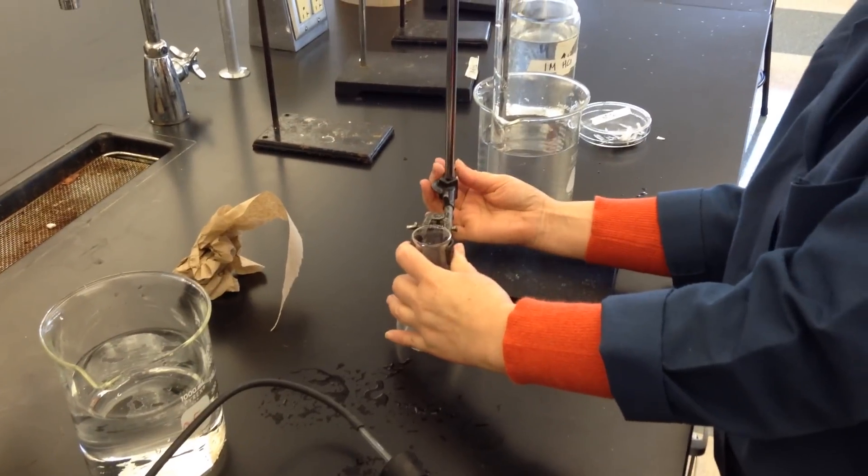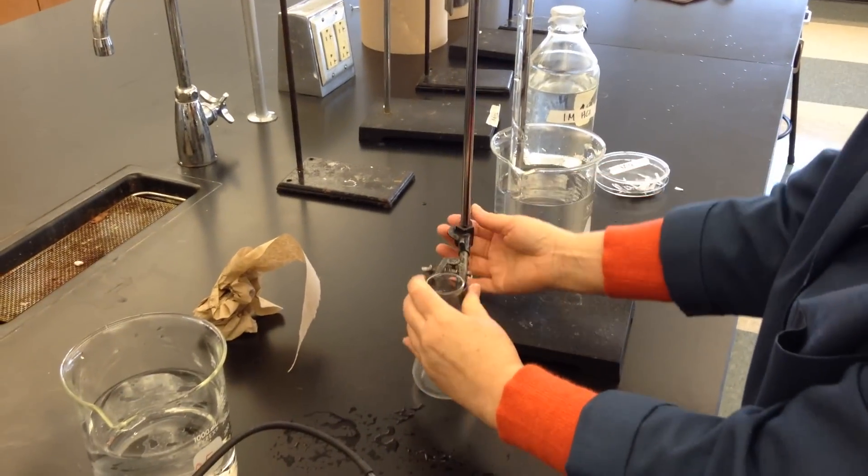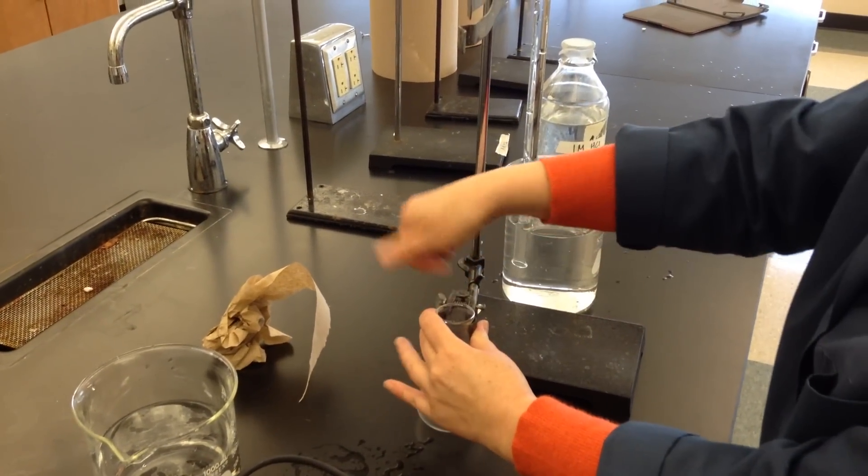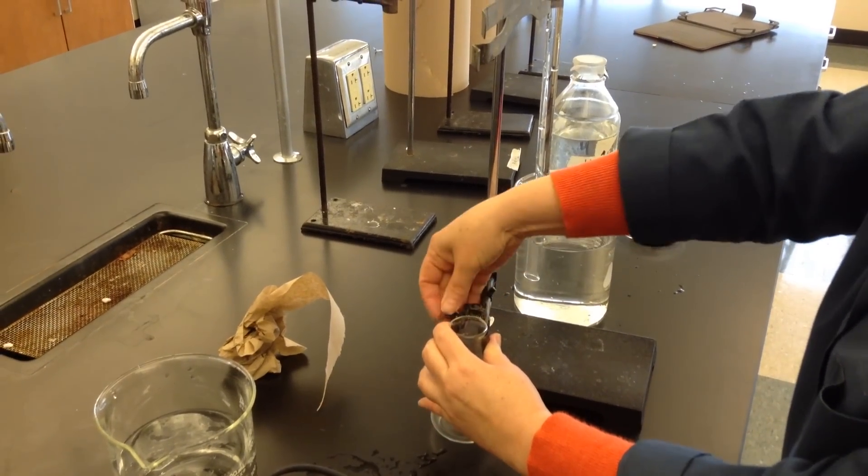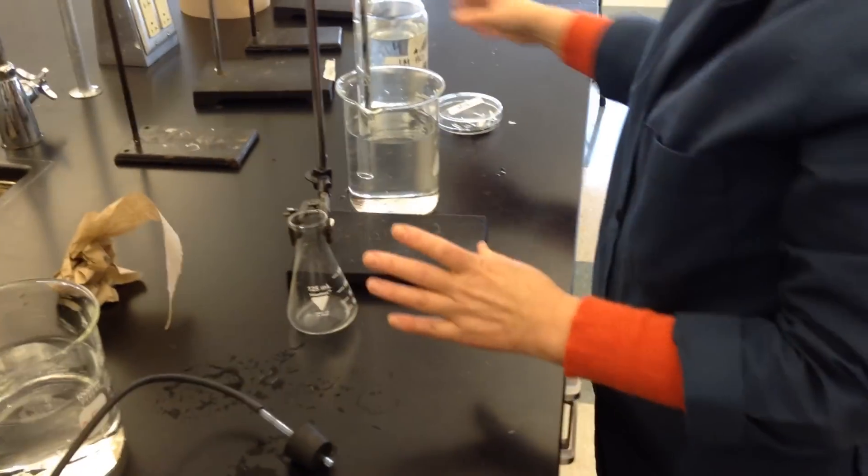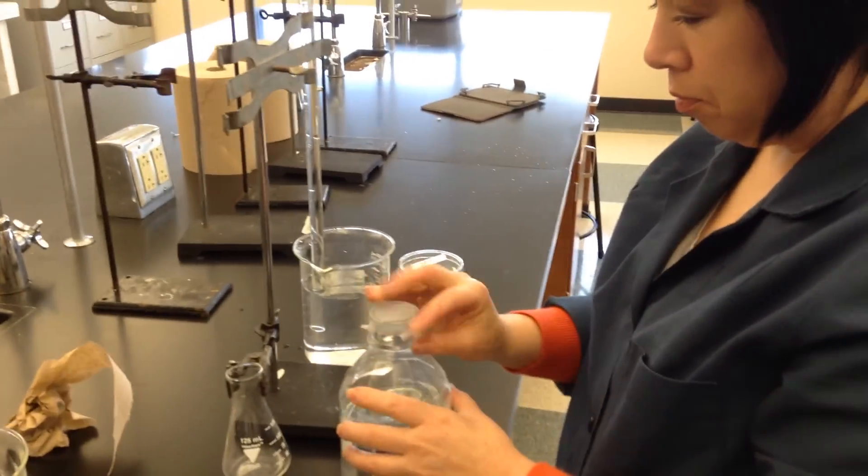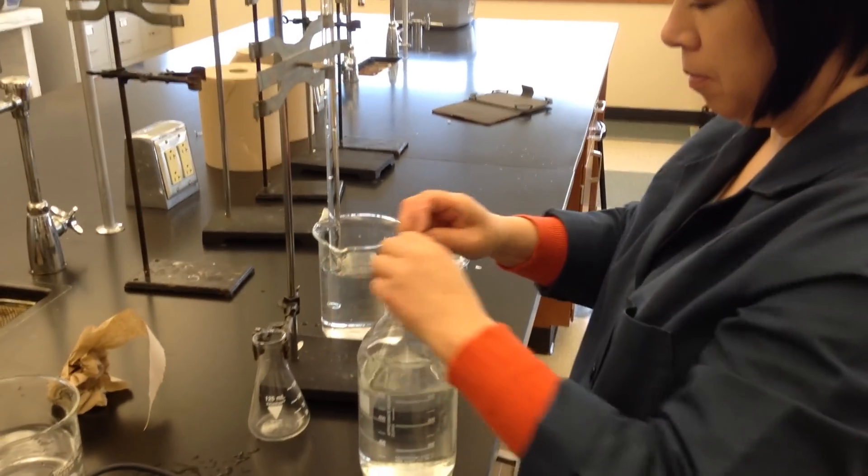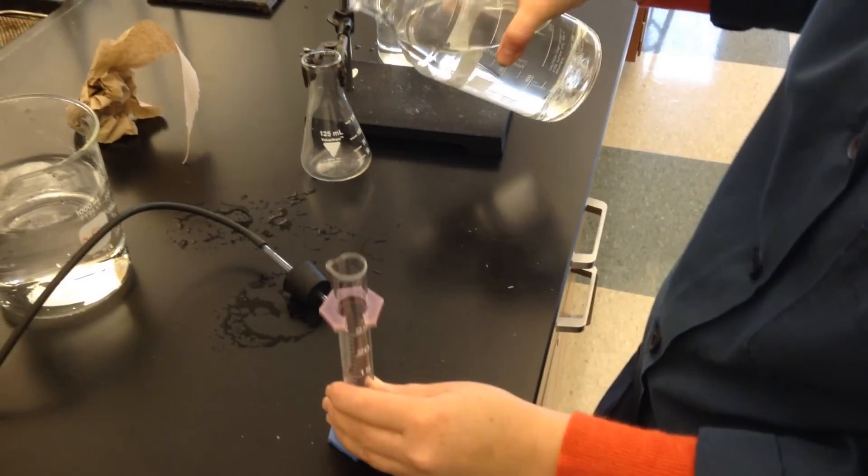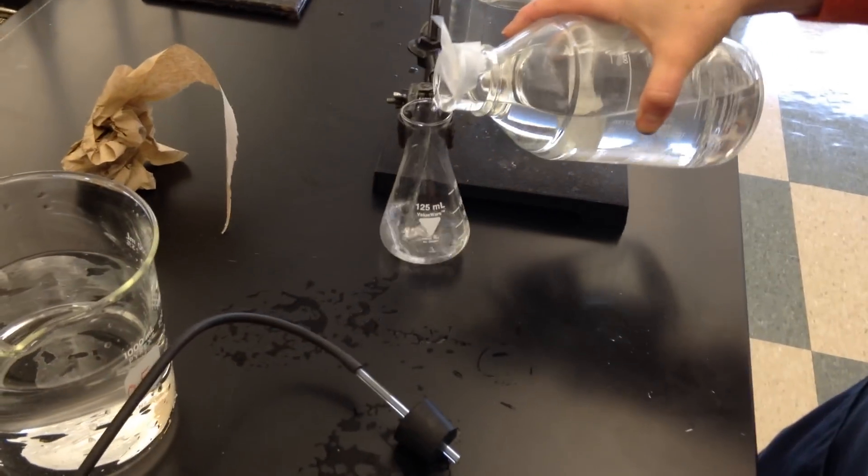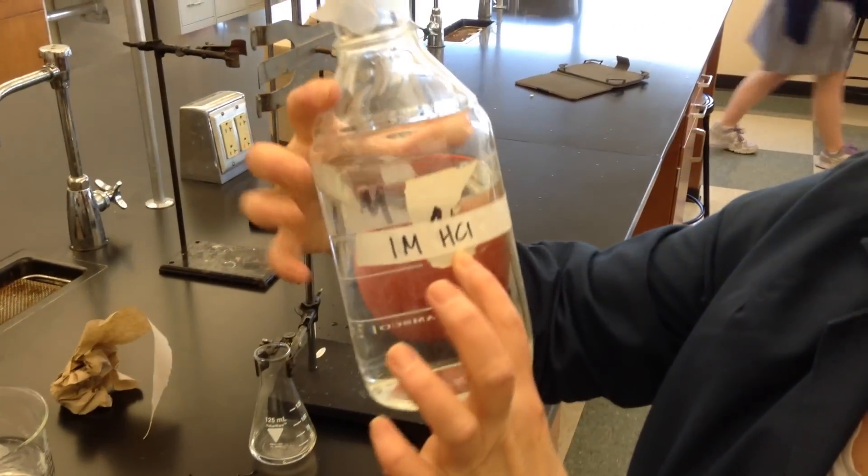And I'm going to do the acid and metal. So I'm going to put a certain volume of acid in here that I have carefully measured. This happens to be one molar hydrochloric acid.